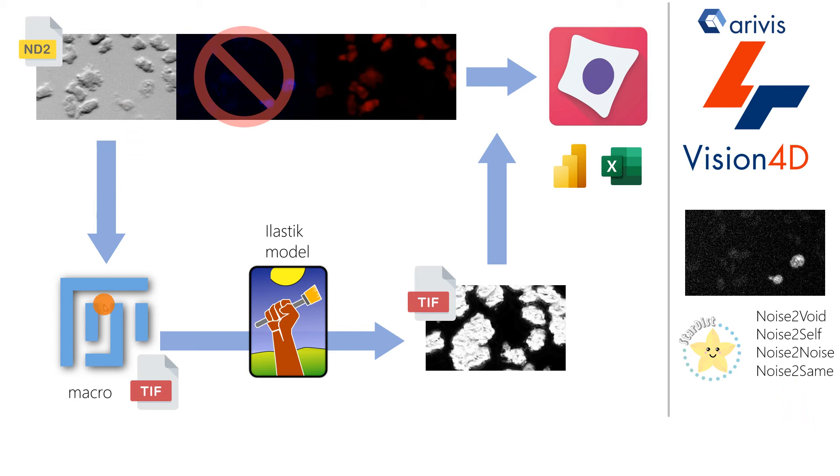To start with in the first part of this tutorial series, we will jump to Fiji and we'll write a macro to export TIFFs.